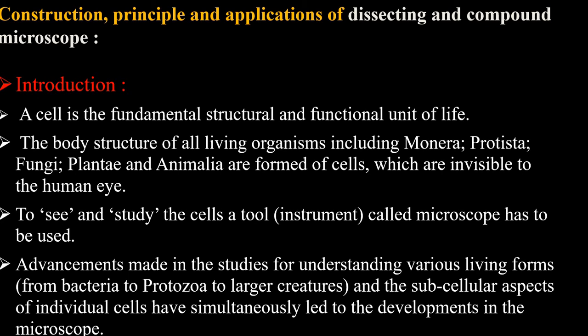Advancement made in the studies for understanding various living forms from bacteria to protozoa to larger creatures, that is multicellular animals, and the subcellular aspects of the individual cells have simultaneously led to the development in microscopy.